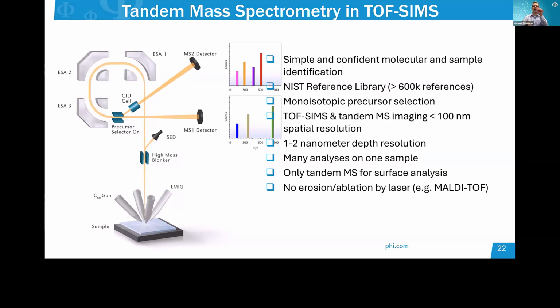So with an unknown peak in the mass spectrum representing some large molecule, we can perform mass spectrometry again on that very molecule. This is done by adding a separate time of flight column with a second detector, which is called MS2, as well as a precursor deflection mechanism to select and redirect an ion with a known mass, but an unknown identity, into that second column, right?